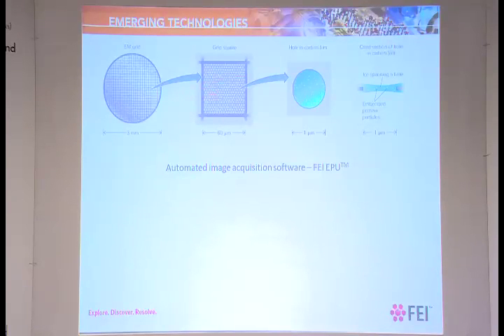We have companies like Quantifoil, which have these regularly spaced holes in the film. So this has also greatly helped with automation, because we can just search for these holes and move along one by one, which I'll explain later.